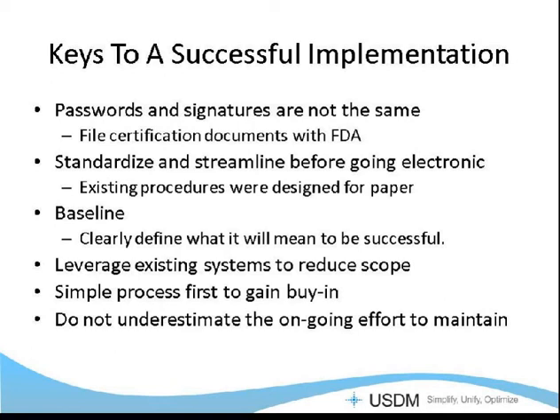Also, I would suggest that you start very simply. These things can grow exponentially. There's a lot of effort involved. There's one example in a lab that I worked in where we decided to use automatic pipette calibrations as our proof of concept, and we saved about 5 hours per month. Doesn't sound like a lot, but it was a very simple thing to do. It took an hour to create a method, and we did a simple validation of it, and then we had the 5 hours to show the types of savings that we could have and also get people familiar with the system.